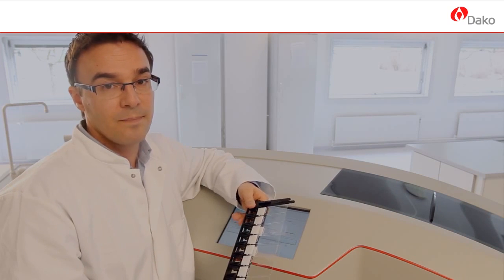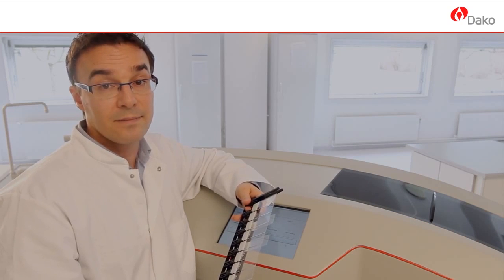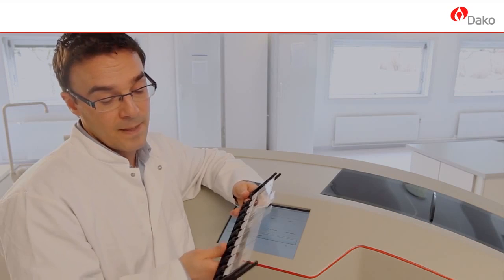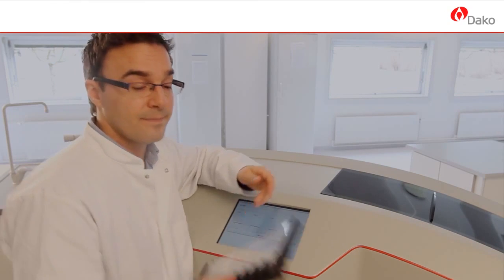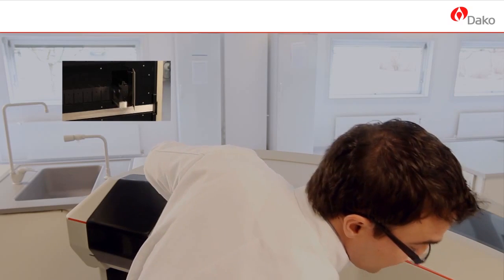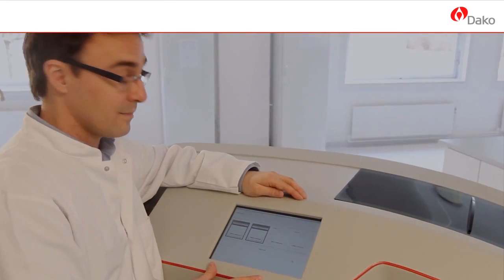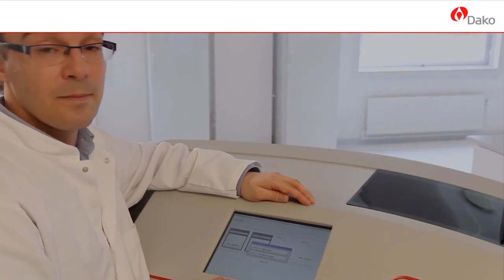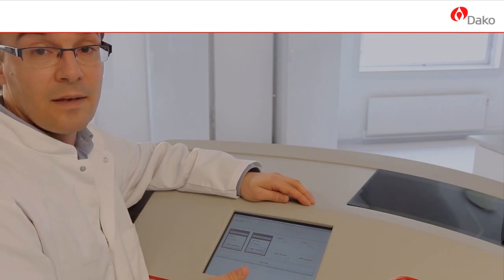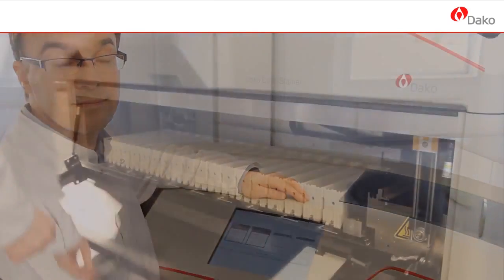Each rack has to have the same protocol, but you can load 4 racks simultaneously in the inlet, and they can have different protocols. So when you have the racks, you go to the inlet, you place them in the inlet, the sensors are activated, and you select the protocol of choice. When that's done, you close the tray and the staining starts.